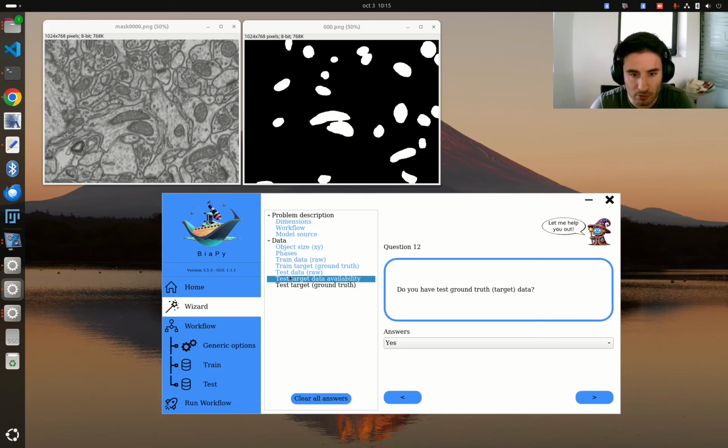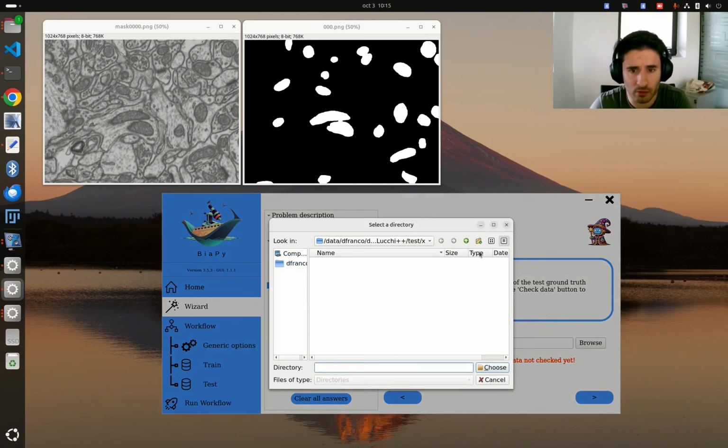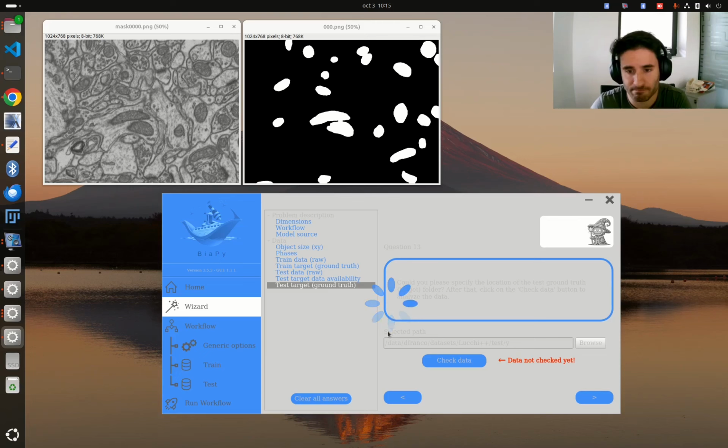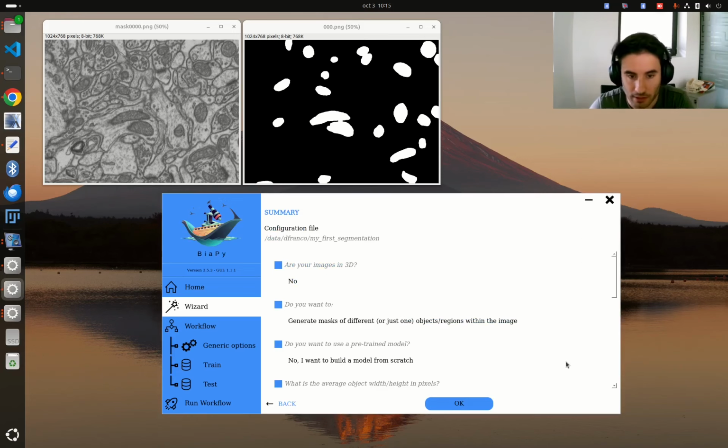So in this case we have the test data. The ground truth in this case is here. And then I need to check the data also. So everything is set.